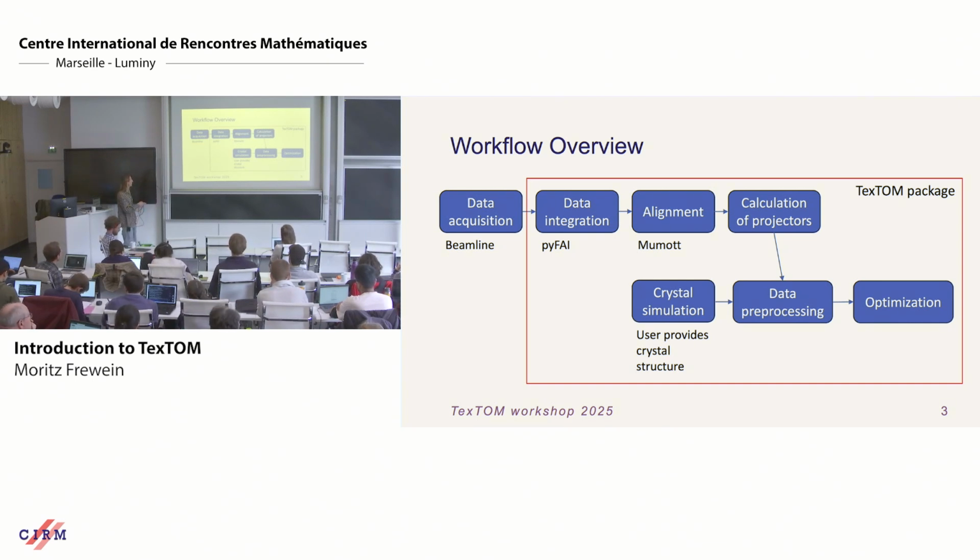And then these two parts here are the model, which I described in the morning. We have to calculate the beam paths for every configuration. We have to simulate our crystal structure, and then we can combine these and get data available for the optimization.